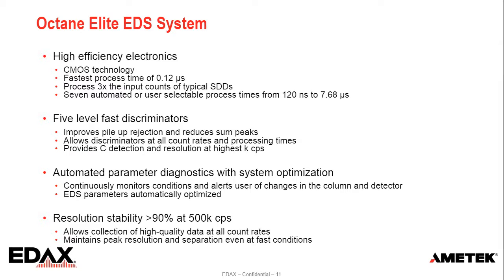This was a general overview of the EDAX EDS world. Now I would like to go through the APEX software and do this on the live system. I will present to you how the data collection and the qualitative as well as the quantitative analysis work.